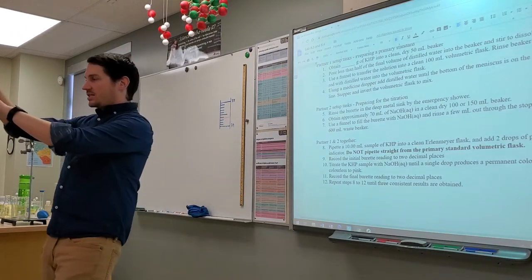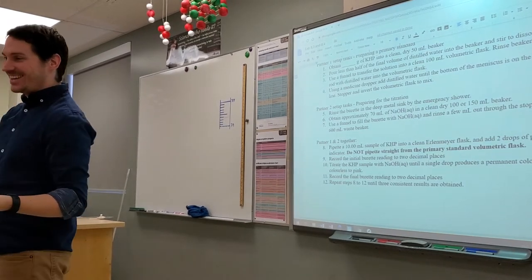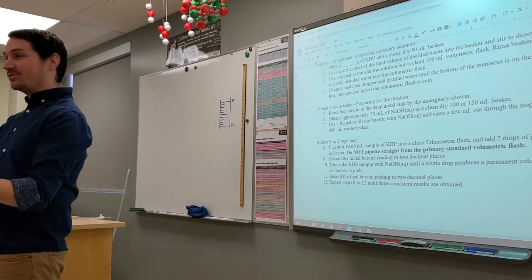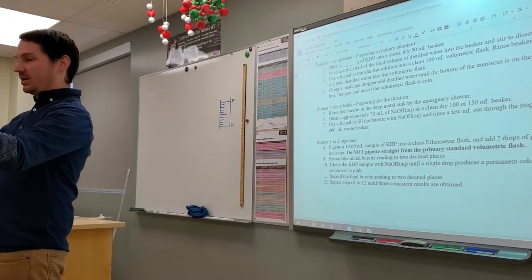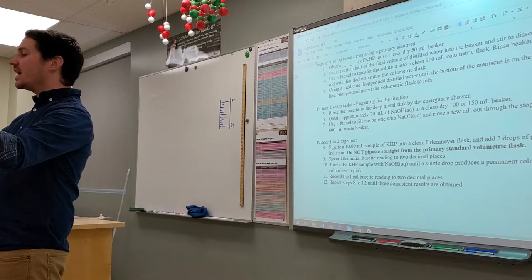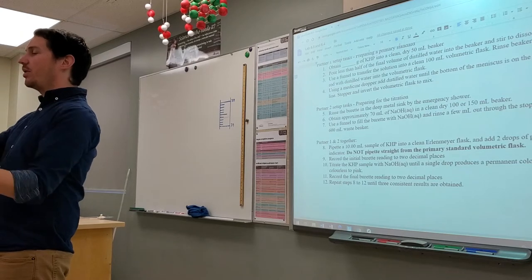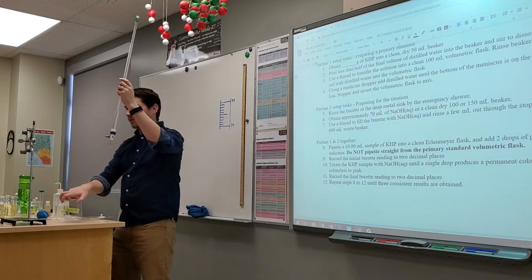So now I've got my sodium hydroxide a little bit in here, and you're just going to take it and, ever so carefully, what happens if you accidentally tip it too much? It's going to come out the other side, right? So just carefully take it and, sometimes it likes to kind of take off on you, you're just going to coat the inside of it with the sodium hydroxide, just so that if there was anything in here that was acidic, it's neutralized now. Perfect. So you're going to take this, and you're going to flush it out into a waste beaker.